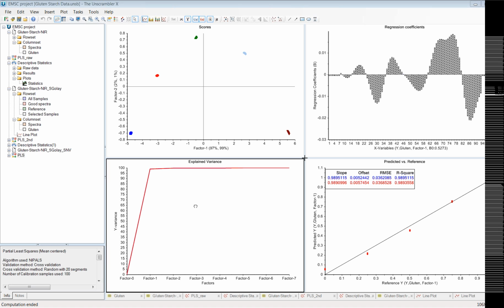The reason that I say that I knew that this was a one-factor model is because it was a mixture, right? So determining the number of factors, you want to know what you're looking at, know what your sample is. You should be able to have a decent understanding of how many things should be changing. And so you can use the number of factors of the things you're expecting to change plus 1 as kind of a rule of thumb.